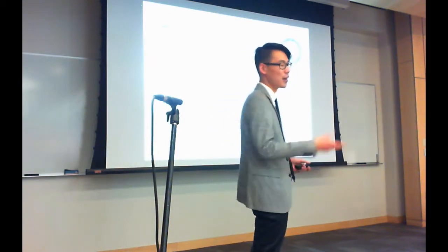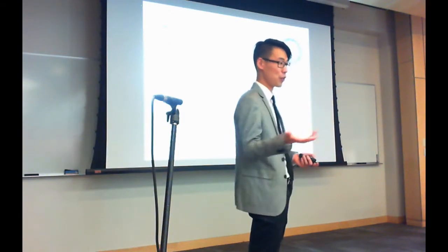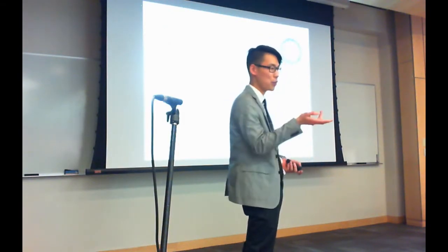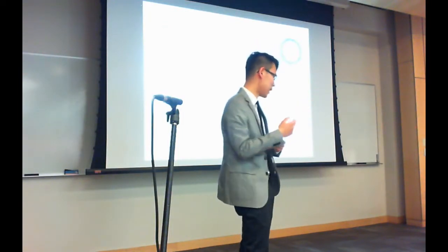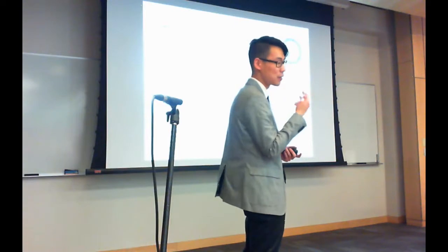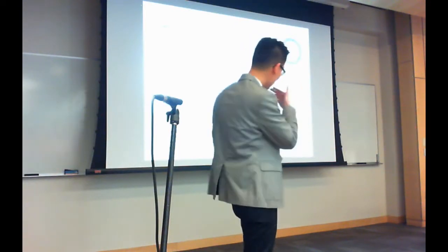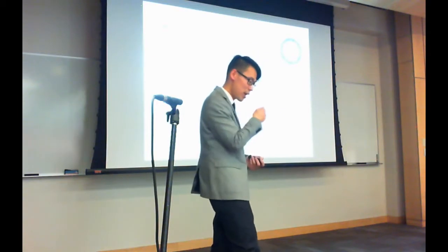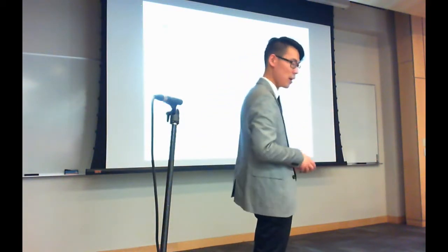For a particular spectrum, you can do a database search on it, like in our library. We want to remove ambiguity. If there is a swizzle of amino acids, and there are no distinguishing peaks between those two variants, we remove it. So we take the library and we research it, and we define a score cutoff.